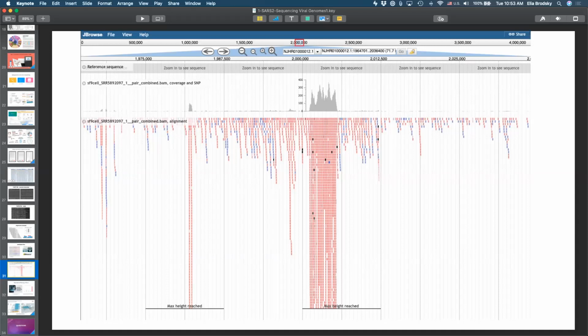When we talk about targets for drugs and finding those conserved regions, we need to start looking at the variation, then understand which areas that variation is present in. And once we have high confidence that a position is of interest and is indeed a drug target, we can then continue to sequence and look for those positions. That is something that people do.